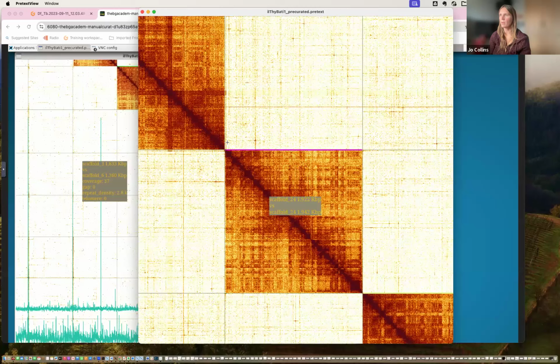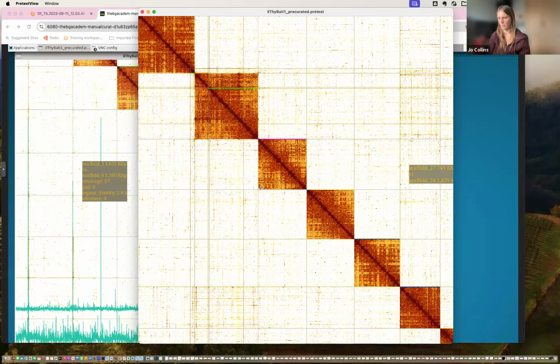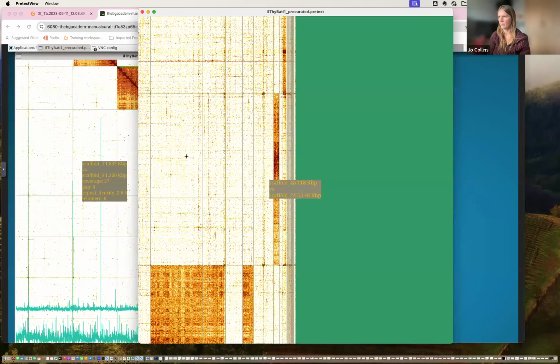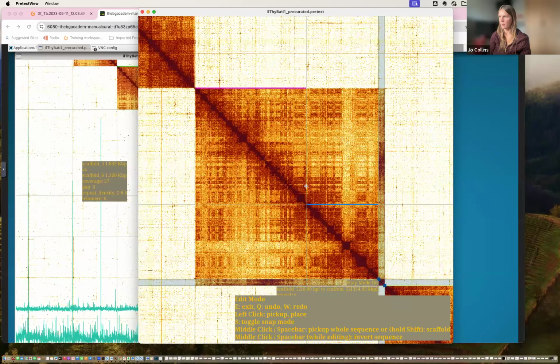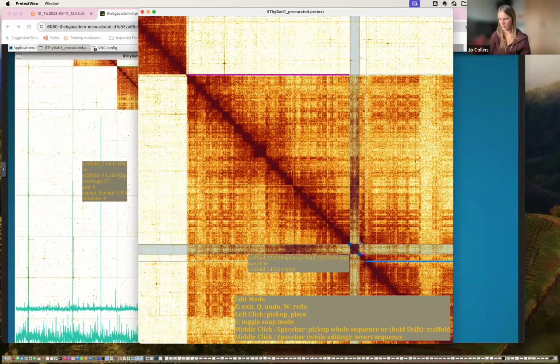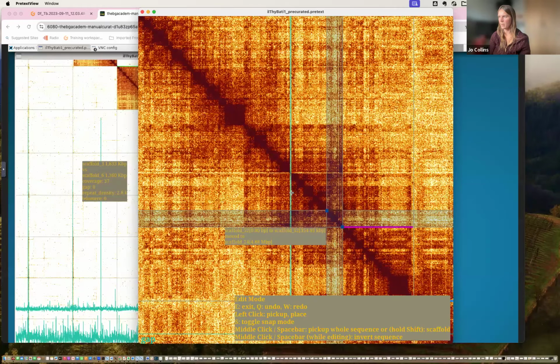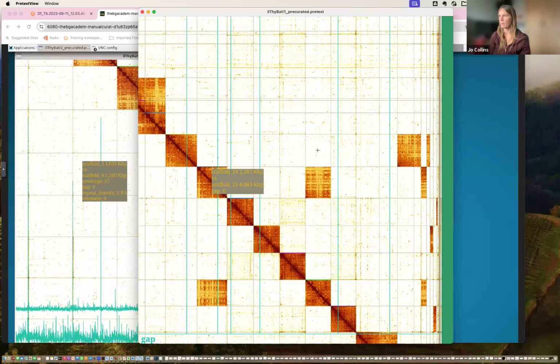Right, so carry on going through. That looks okay. You've got a really strong match here. We'll bring that over, confident with our join. Again, this piece, so I've got my S off. I'll leave it there for a second. So I'm going to put my gaps on. And as is typical, we have a gap at this location, and we can flip and place our scaffold in. That's everything for that one.